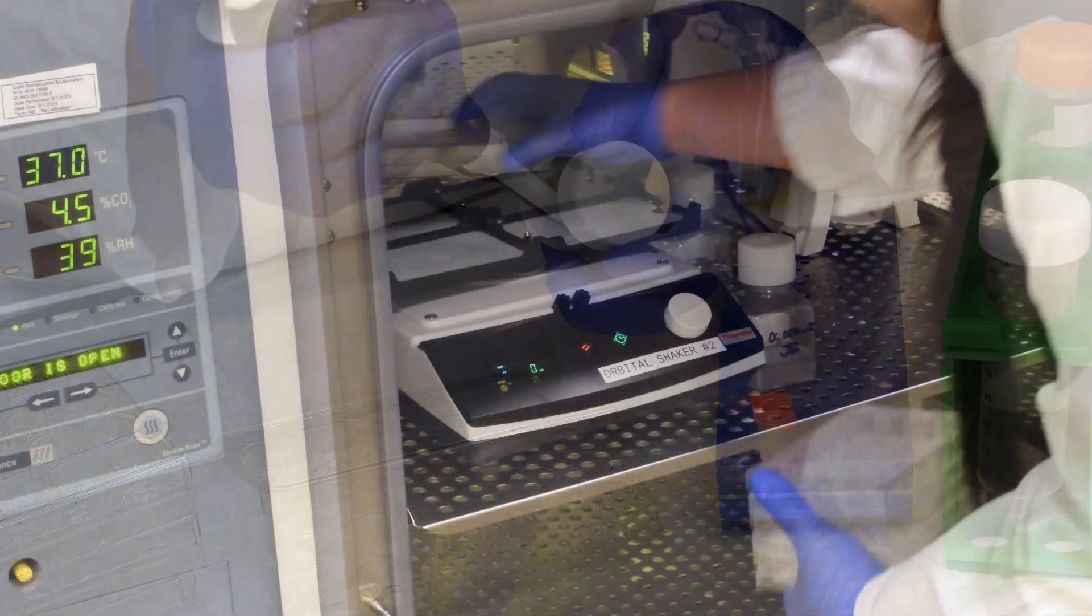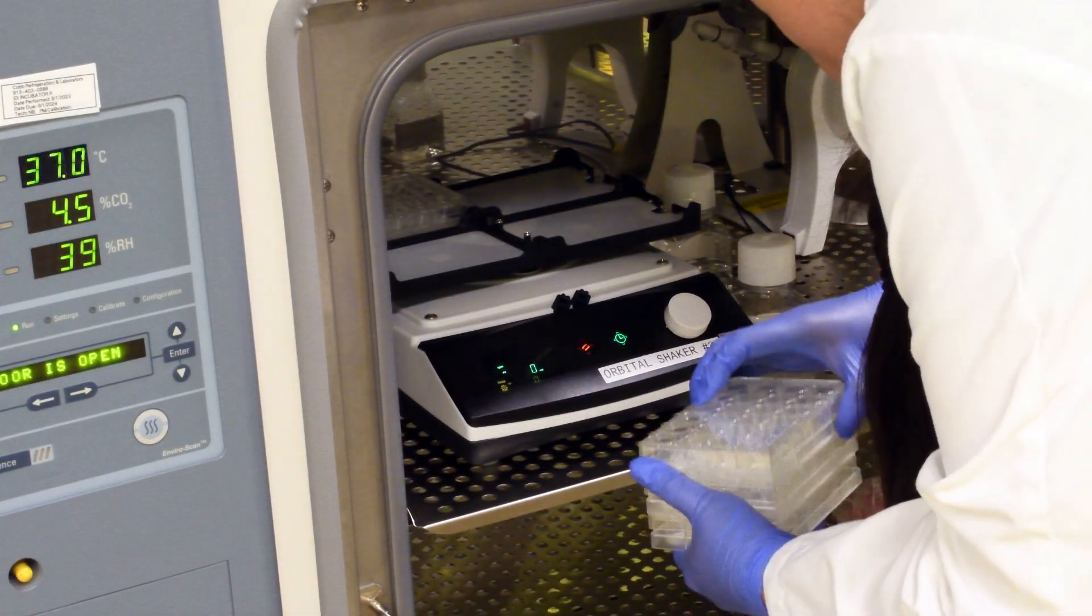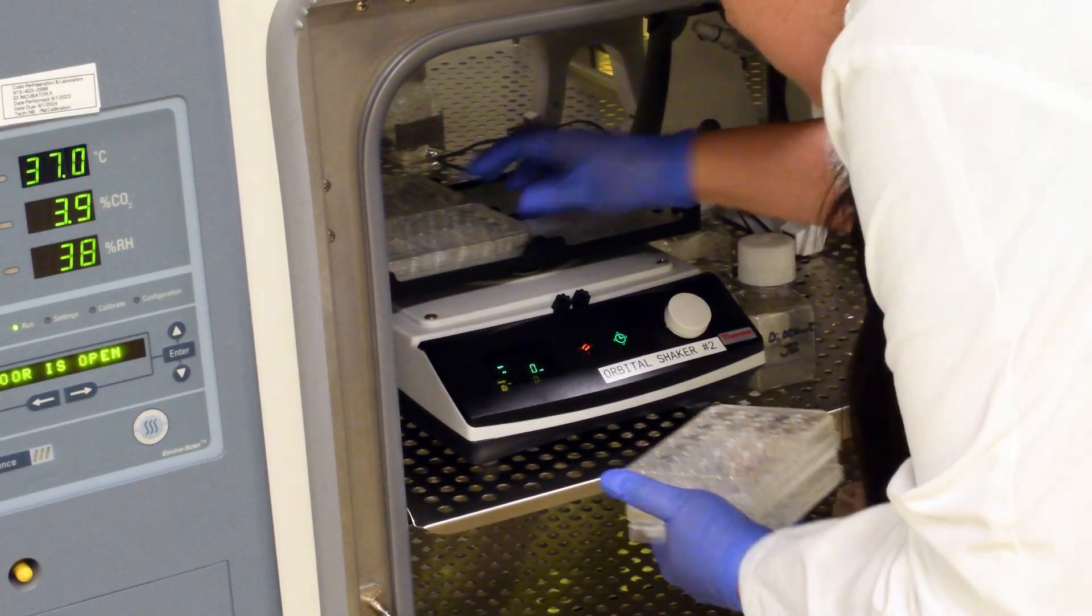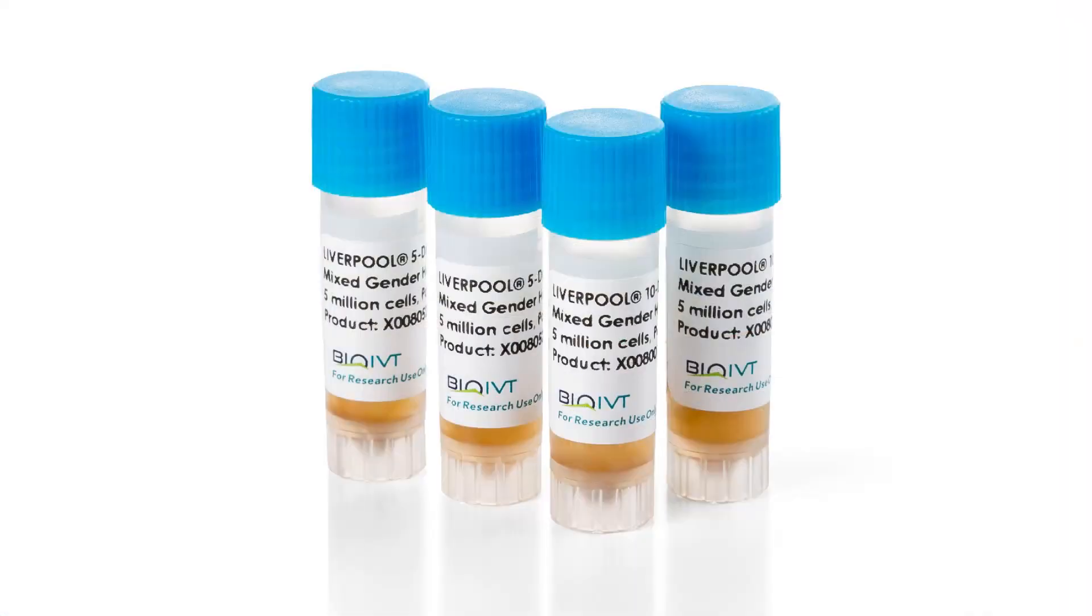Preplate the test article into wells and place the plates in 37 degrees Celsius incubator. After the plates are loaded and placed in the incubator, begin thawing the hepatocytes.